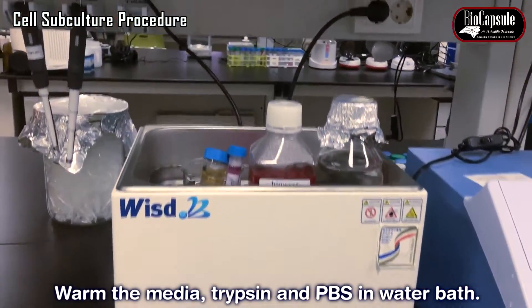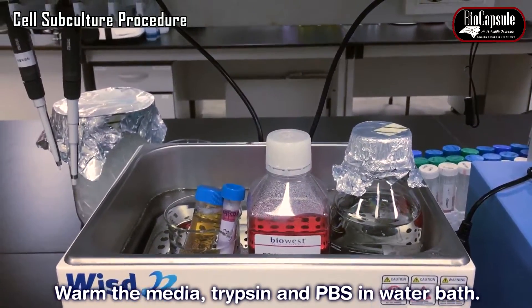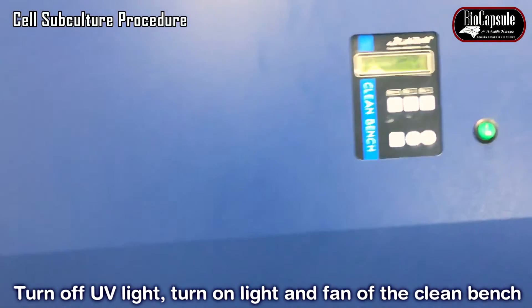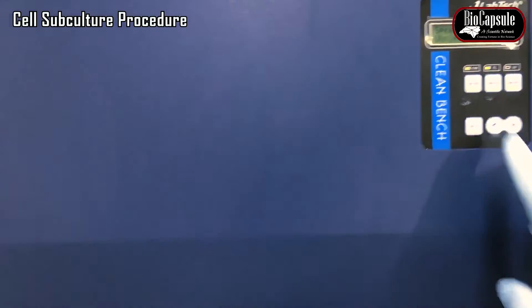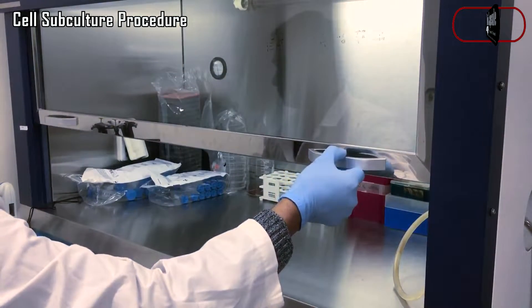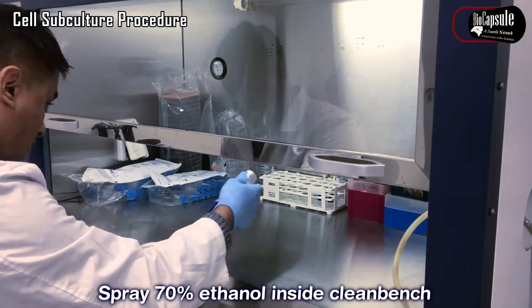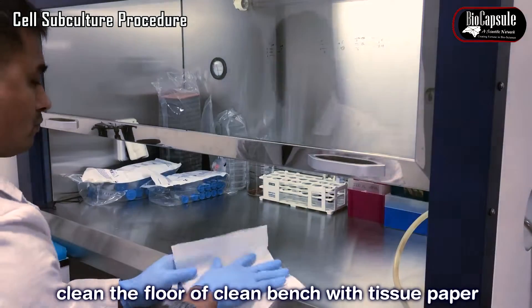Culture medium, PBS, and trypsin should be warmed up to 37 degrees centigrade in a water bath. Turn off the UV light, turn on the light and fan on the clean bench. Spread 70% ethanol inside the clean bench and clean the floor of the clean bench with tissue paper.